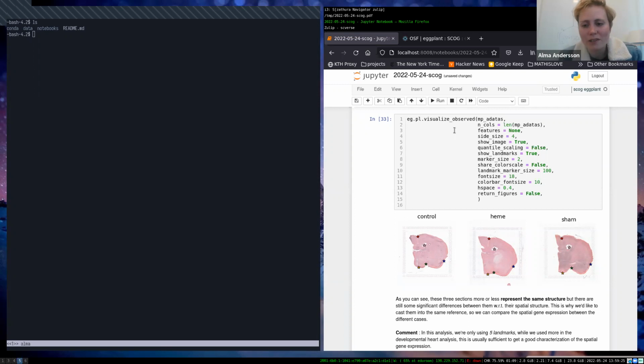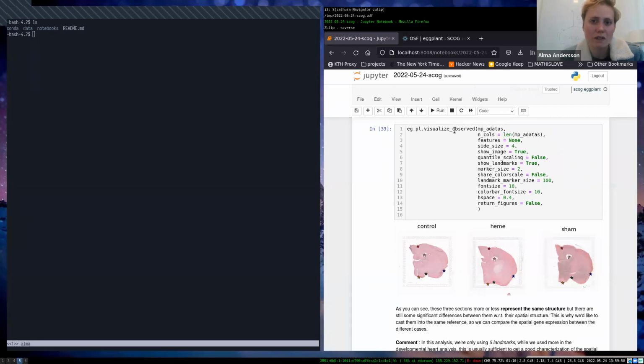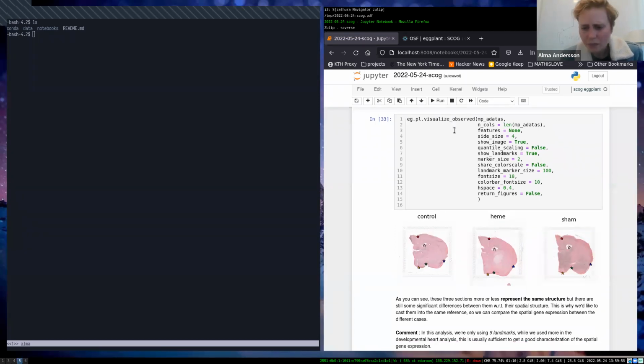Right now, all that you need is an image where you have your reference colored in a different color compared to the background. I wanted to keep this reference creation process as simple as possible. I didn't want to make it too complicated. So you can more or less use Paint, just draw a figure, and that's supposed to represent your data. Of course, you can also put way more effort into this if you're familiar with the tissue and know what the integral elements are and what should really be included there. That's something you can incorporate into the creation of this reference image. But that's actually all you need: an image where you have a background color and something that's colored in a different way. That's what's being loaded in here and what's then used to create this grid and then build the reference object.